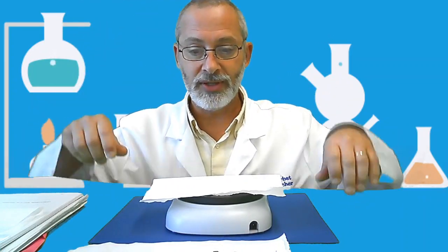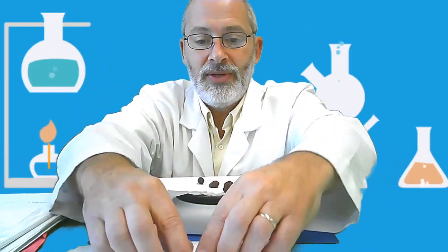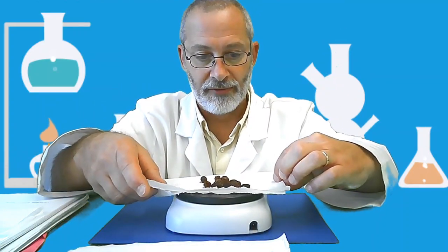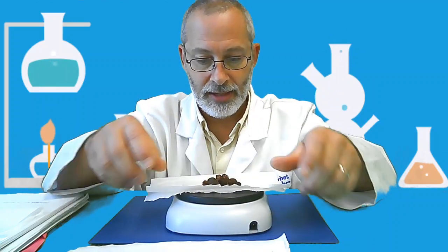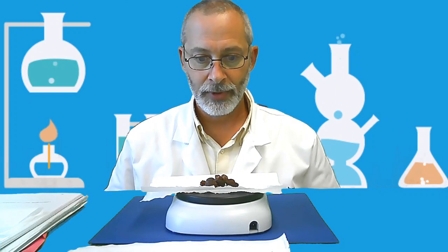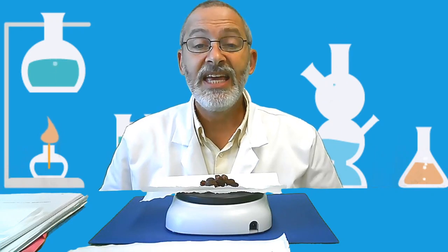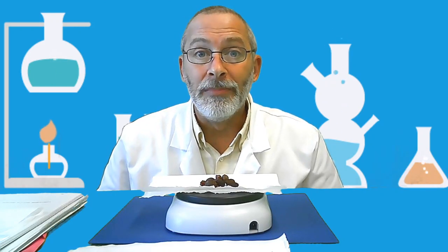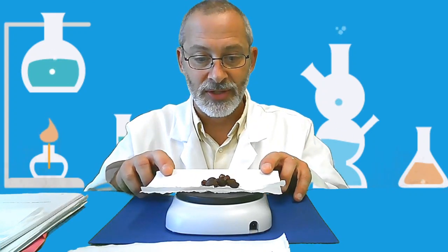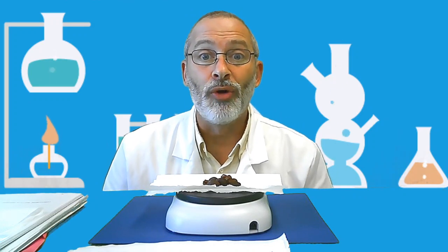So I'm zeroing this out again. And now I'm going to place all 10 raisins, 1, 2, 3, 4, 5, 6, 7, 8, 9, 10. Good, we got all 10 of them. And we're putting them back on the digital balance, and let's see what their mass is. Oh my! All right, the new mass for day 2, 10 grams. These plump little raisins, all 10 of them, have a mass now of 10 grams.